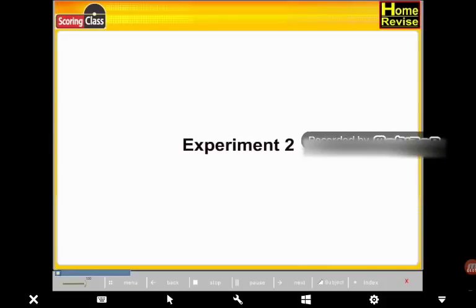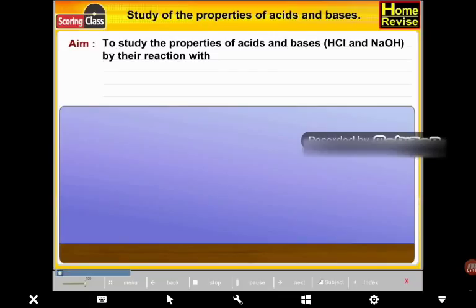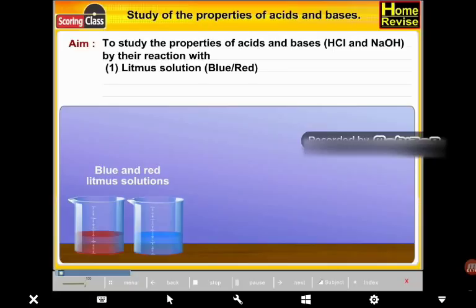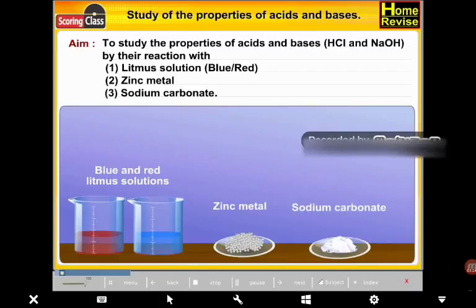Experiment 2: Study of the properties of acids and bases. Aim: To study the properties of acids and bases — HCl and NaOH — by their reaction with (1) litmus solution (blue or red), (2) zinc metal, and (3) sodium carbonate.